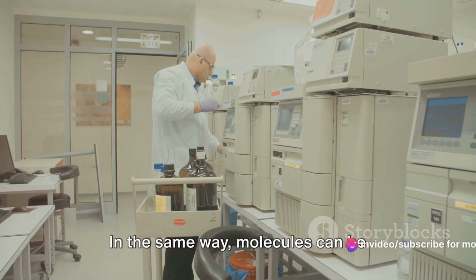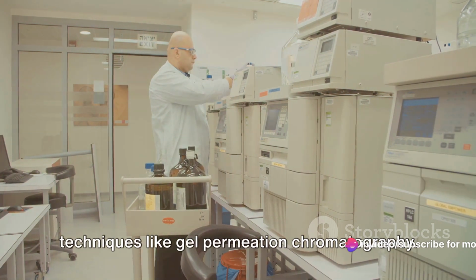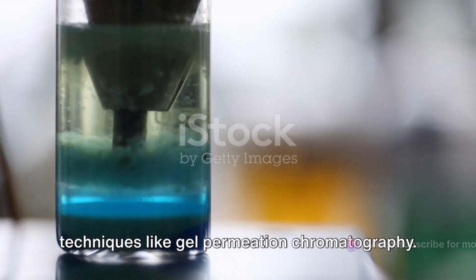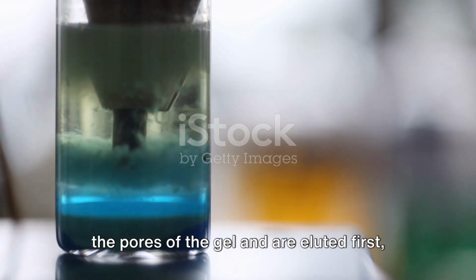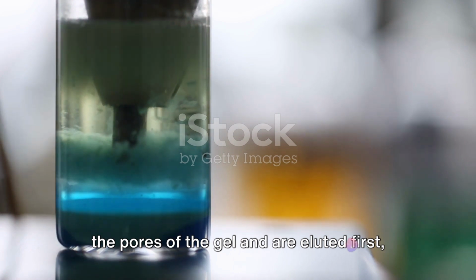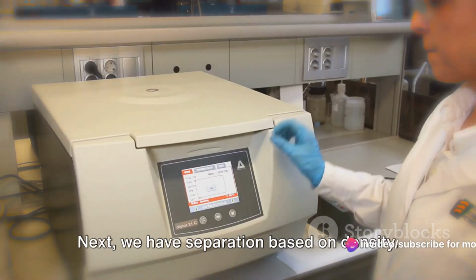In the same way, molecules can be separated based on their size, using techniques like gel permeation chromatography. The larger molecules are unable to enter the pores of the gel and are eluted first, while smaller molecules enter the gel and take longer to elute.